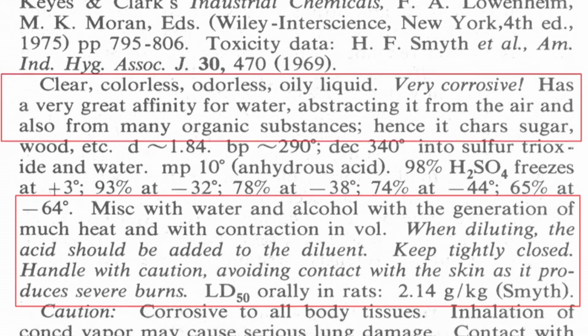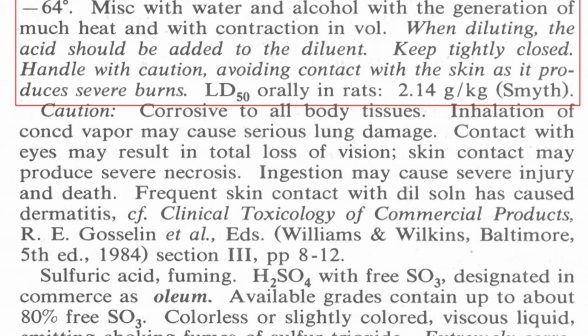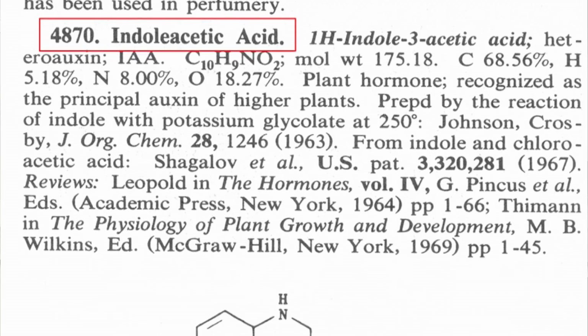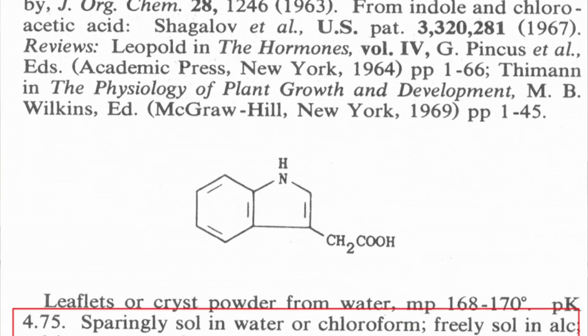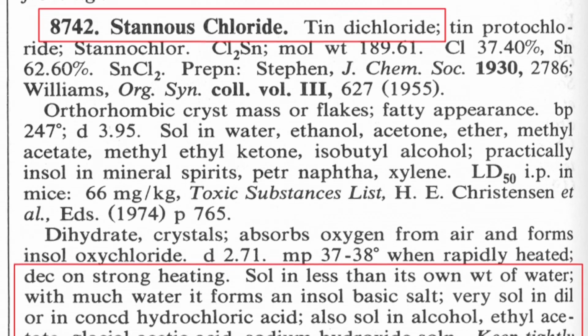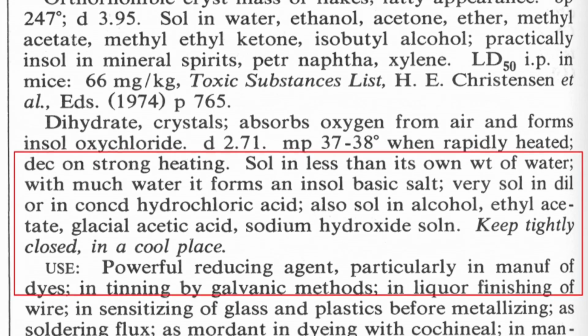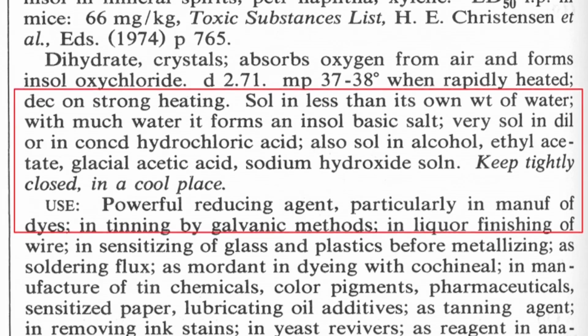Safety data sheets. It will tell you about how the chemical's found, how it's made, what you can do with it, what it's used for commonly. But it also tells you a lot about physical properties. So it might tell you it dissolves in benzene, it might dissolve in alcohol, it might dissolve in pH 9, but nothing below that. This is the information you need, because if you need to dissolve your chemical, it has to go in the right substance, the right solvent. So this will tell you.